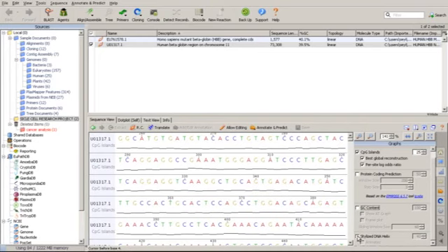Just watch. So that is the stylized DNA helix. This stylized DNA helix is just trying to make us see the animated form of the double DNA element, the double-stranded DNA structure.